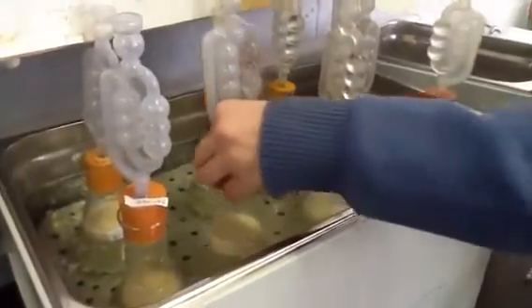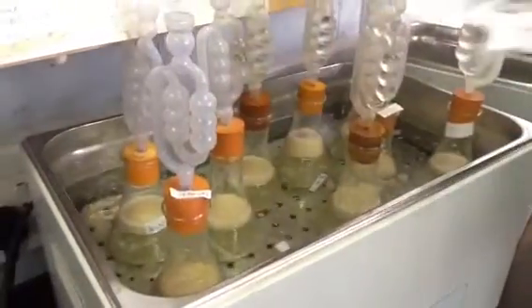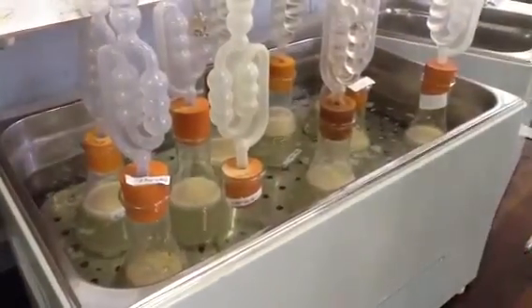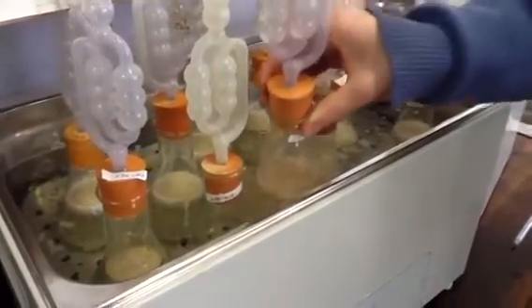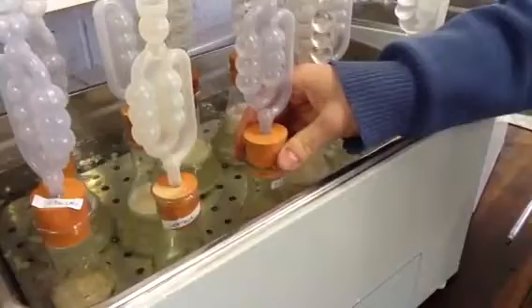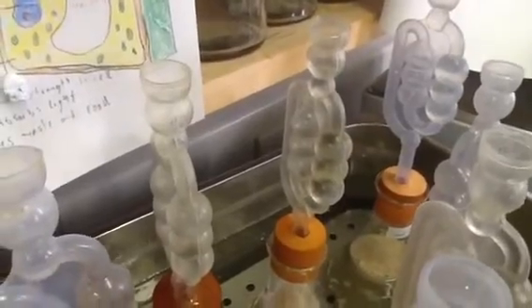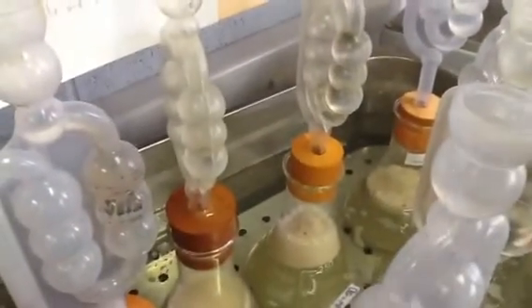We can see the ones that we've put in earlier on as well. That's our control and that's our experiment one. Some of the ones that we have in here from earlier — we can see bubbles of carbon dioxide forming already, and we can see it beginning to bubble here.